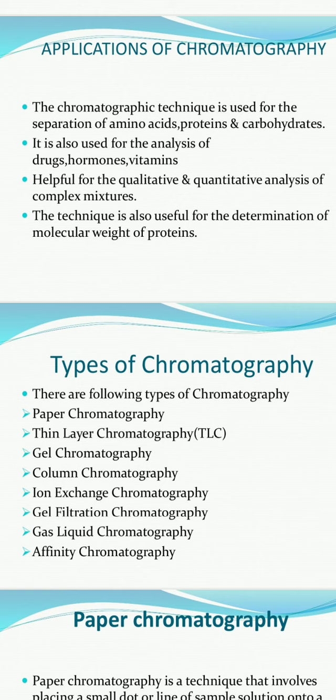And paper chromatography and thin layer chromatography are the techniques that come under planar chromatography. So what is planar chromatography? It is the one in which the stationary phase is either cellulose paper or simple Whatman paper, used for the separation of the molecules. The other term is thin layer chromatography, the short form of which is TLC.